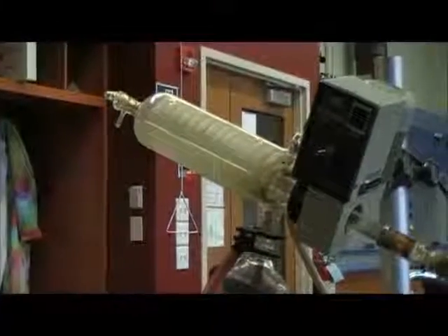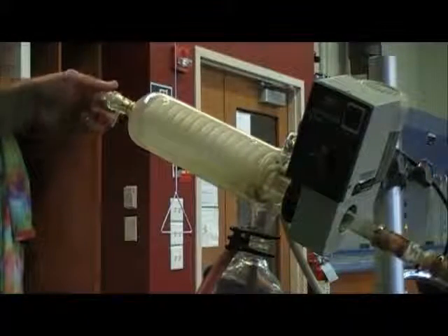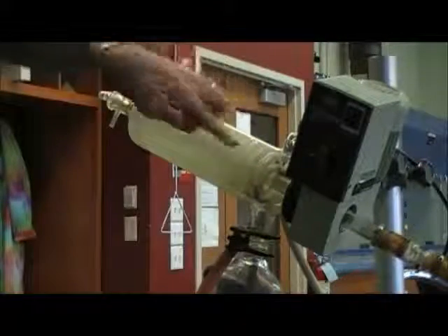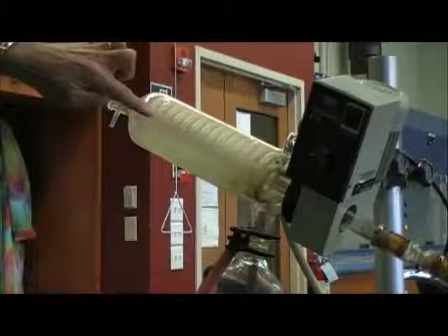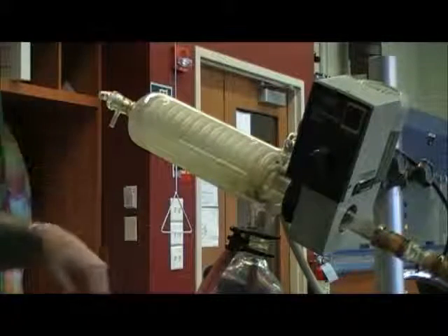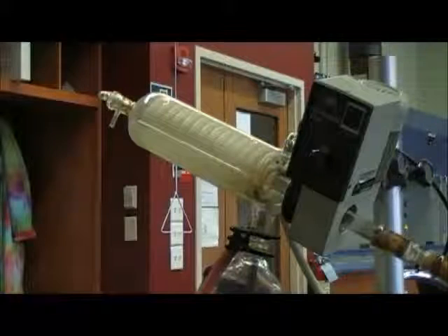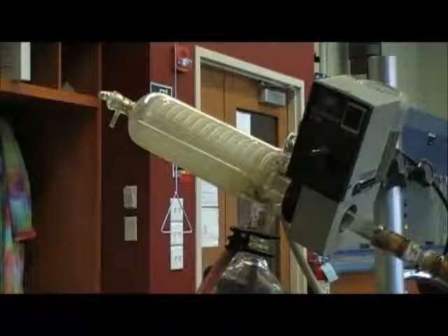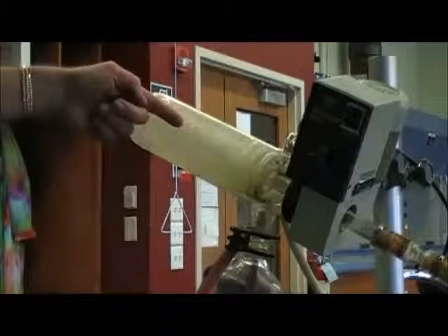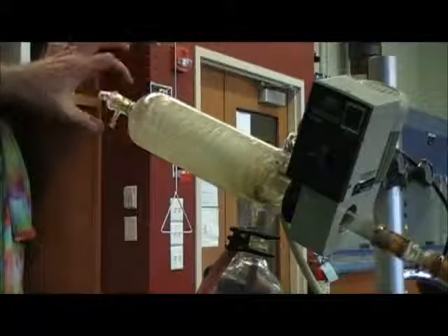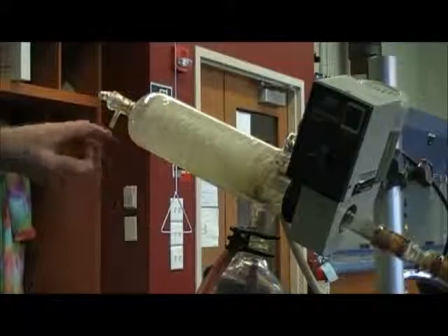This part up here consists of a condenser which is inside. I don't know if you can see it, but there's a spiral in there, and when we turn the water on, hopefully you can see that there's water going through this condenser that's inside of this big glass tube.